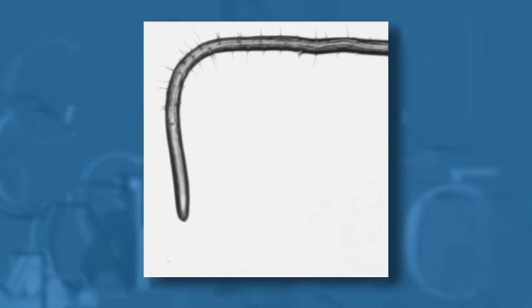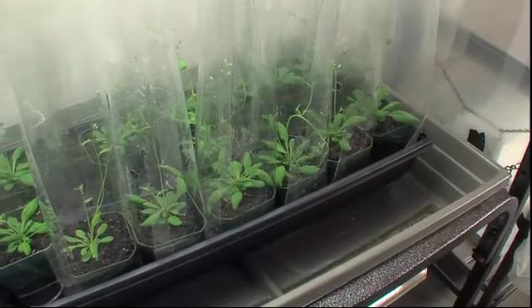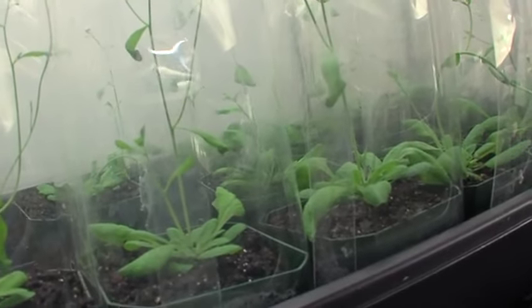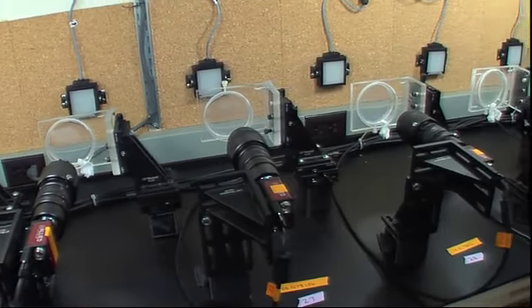And by measuring how those plants grow and develop differently, we are able to infer the function of the gene that's been manipulated. Spalding has genetically modified each of these plants so each grows slightly differently. Specially rigged cameras like these snap their pictures once every 30 seconds or so. Now, these tiny roots are ready for their close-ups.